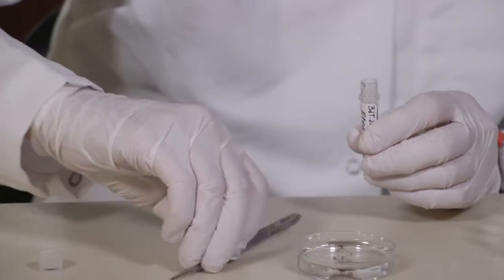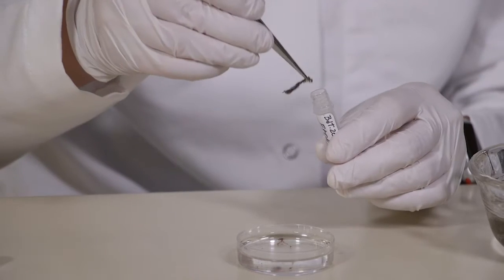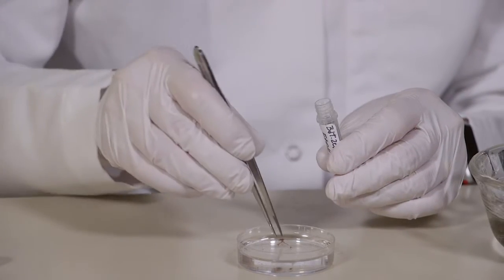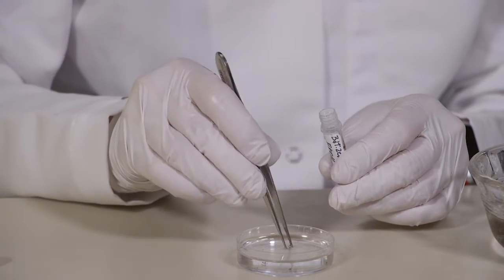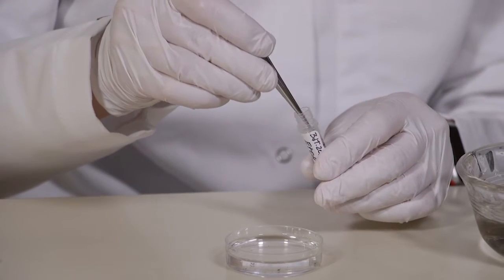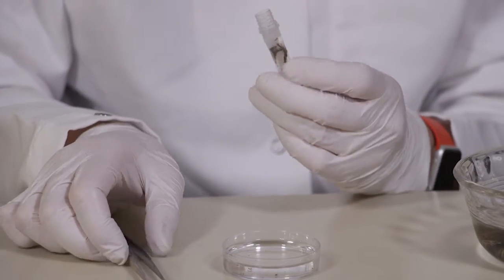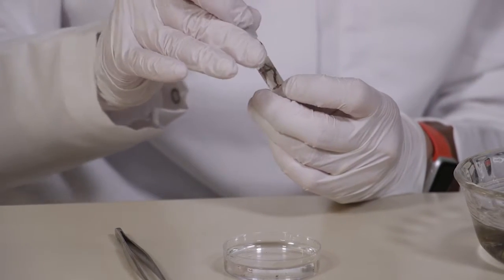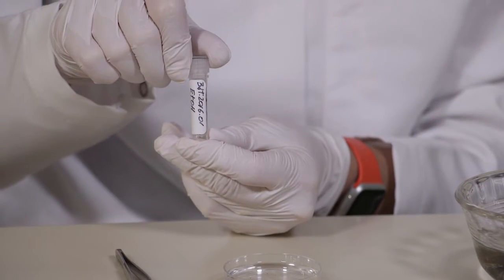You can get your polyps and drop them directly in the ethanol. You don't need to relax them because all you need is the tissue for your molecular analysis. You want to make sure the vial is not too full of polyps and there is enough ethanol for the tissue you're preserving. Your sample is now ready.